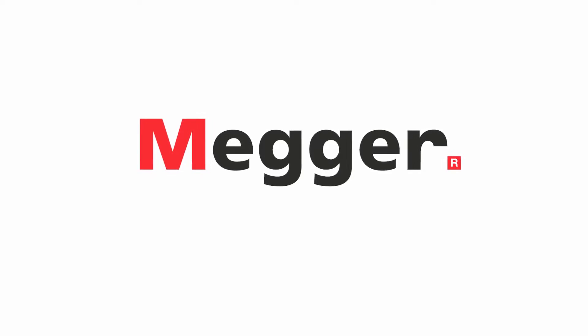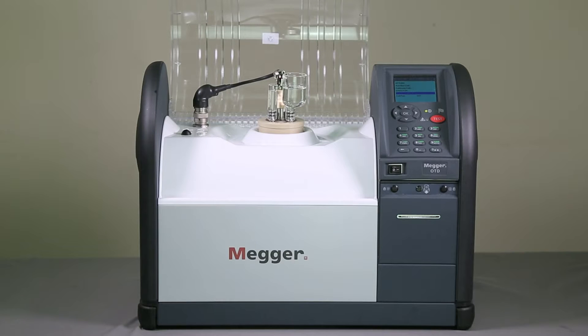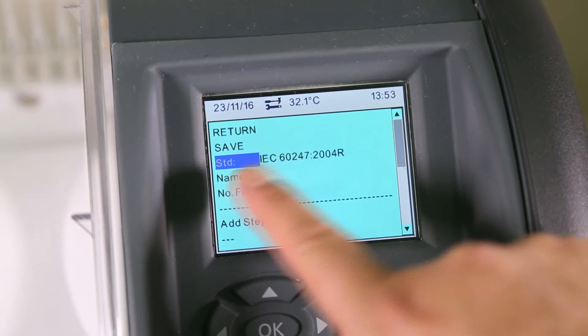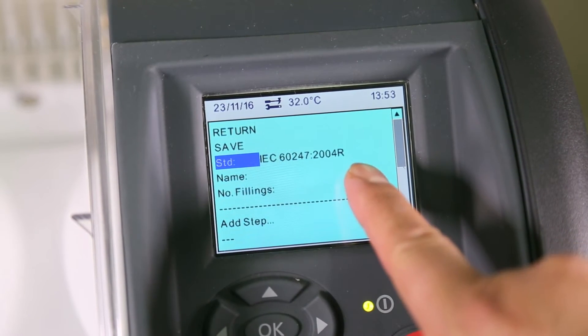This video demonstrates how to manage user-defined tests on the OIL-TAN Delta. To start, we will create a new custom test. Select 'Add a new test'.